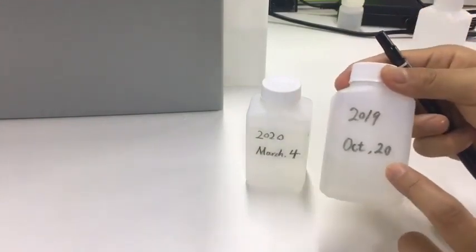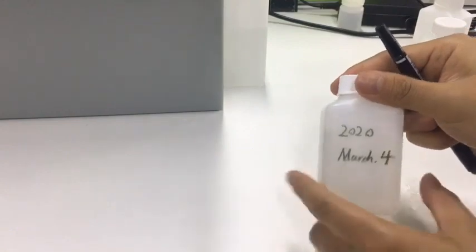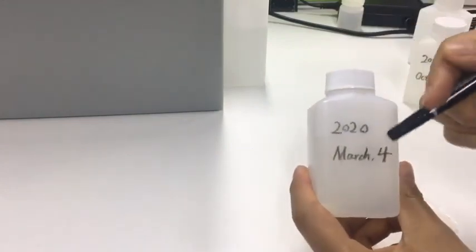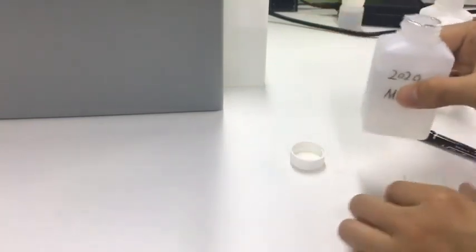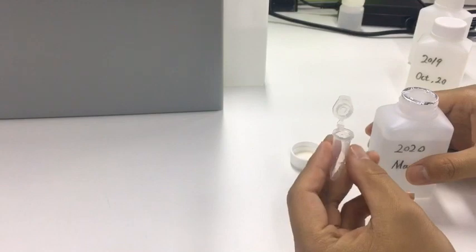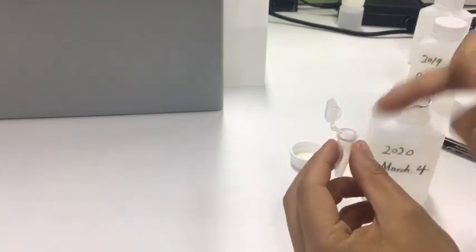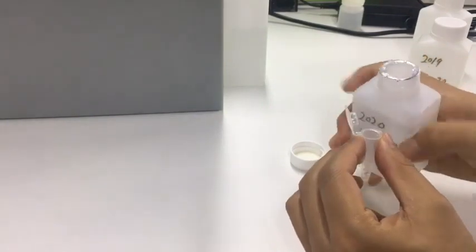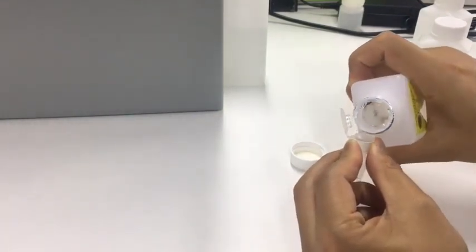This one is already invalid, so we use a new one. This one is opened today. We use a bullet tube to take some solution, prepared for using later. You can use a bullet tube or other small containers to take the solution.